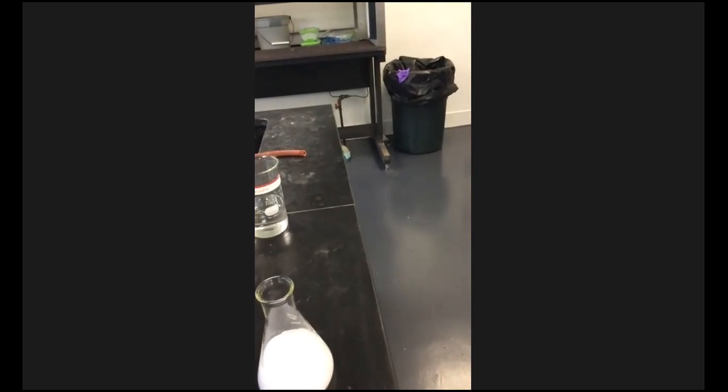That's your calcium oxalate. So when the potassium oxalate and the calcium chloride react, they form calcium oxalate, which is an insoluble solid, so that it precipitates out of solution. Yeah, 2 minutes up. Oh wow, that was quick. All right. So now after we stir for the 2 minutes, we're going to go to the next step, which is we gotta heat it.